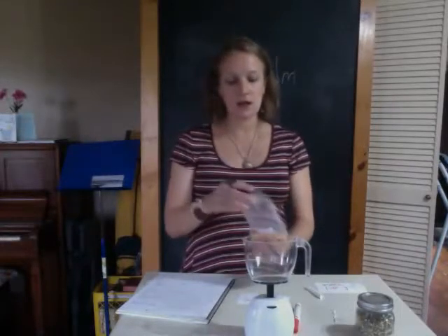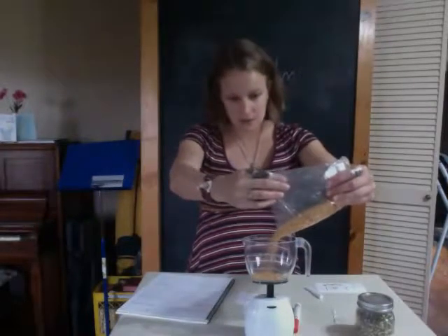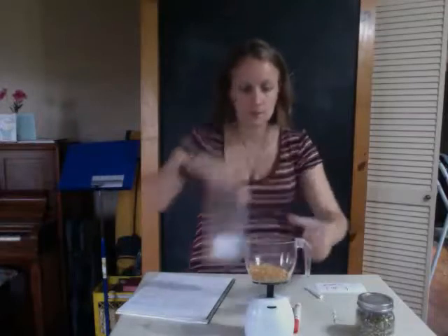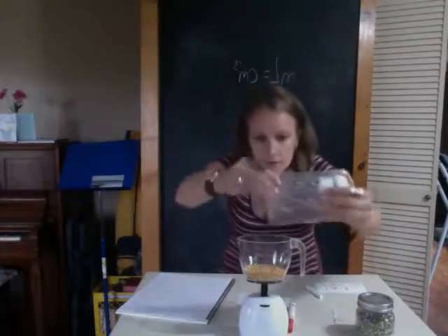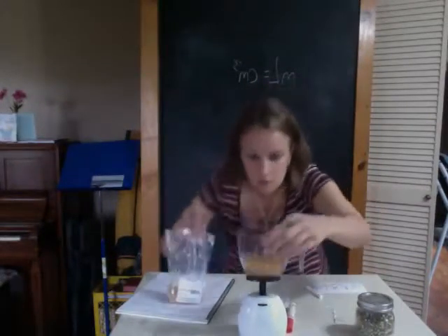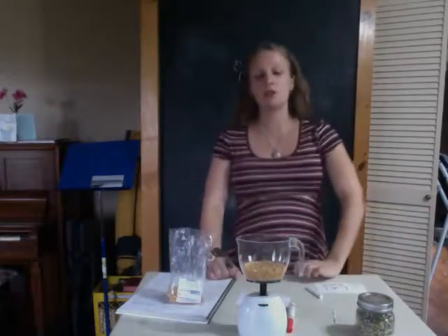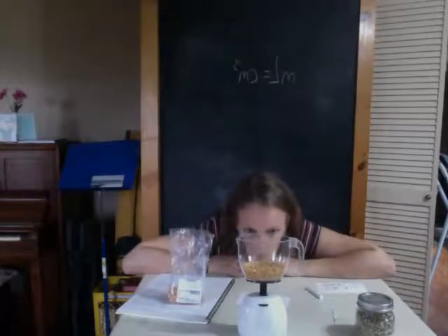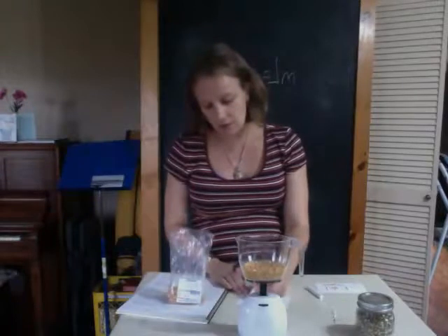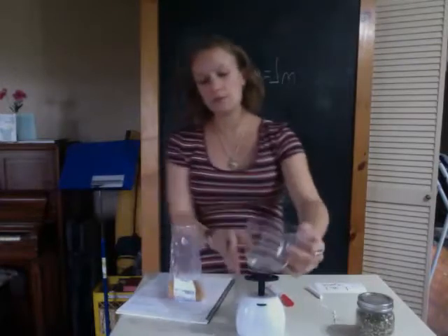So I'm going to try again, mixing it up so I might get different peas. And I have about 100 milliliters here. There's always some human error, which is why we measure the sample 3 times. Okay, and this time it looks like I have more like 70 grams. I'm going to write 70 grams. And I will weigh this a 3rd time.